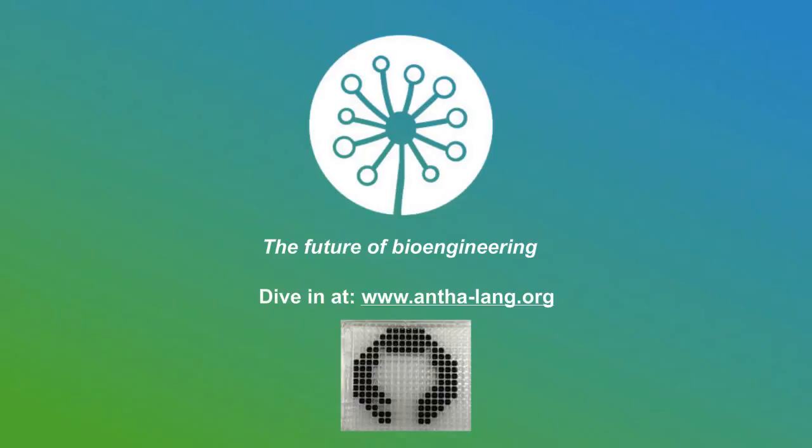Sean, a question has come in. I'd like to pose it to you. The person says, I see and understand the Antha concept from a Lean Six Sigma concept. The question is, how do we get Antha for streamlining Lean Six Sigma biology research?